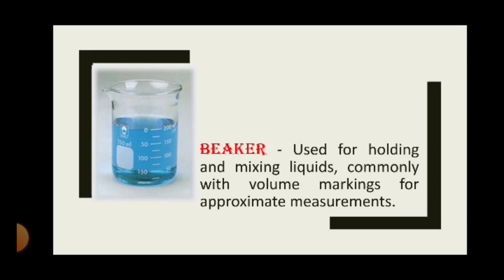So kung gusto mong kumuha ng 100 ml pero hindi naman necessary na exactly 100 ml sa experiment, you can use the beaker to make your work very fast, no? Hindi necessary na very exact din siya. So gamitin mo ang beaker.